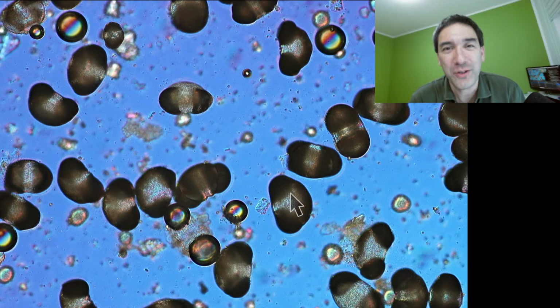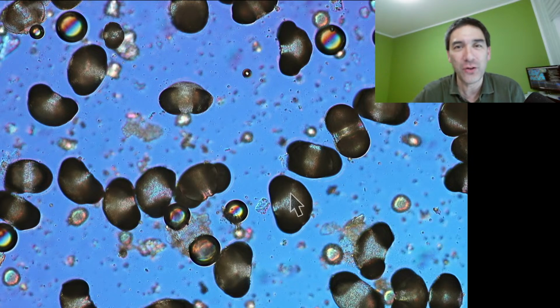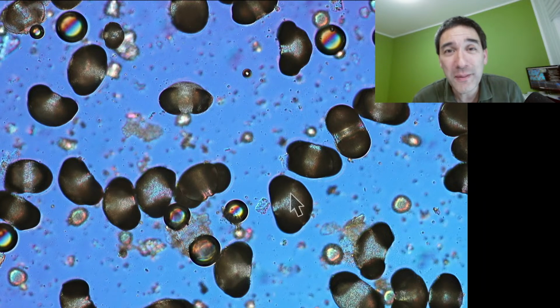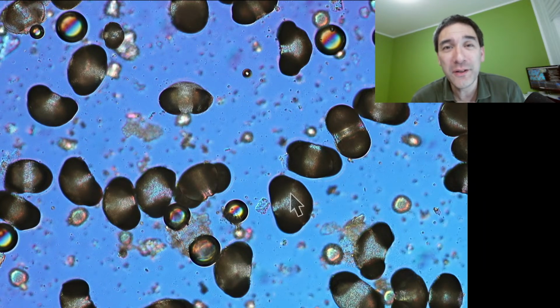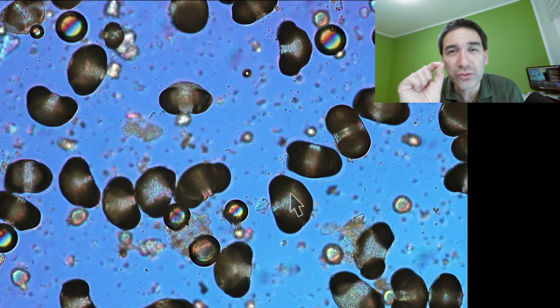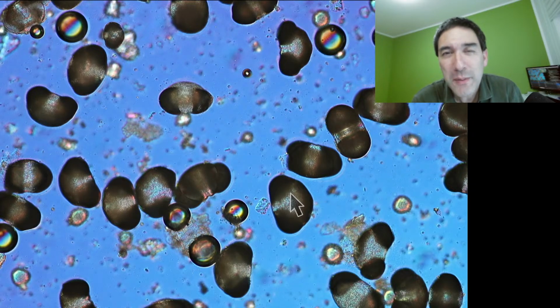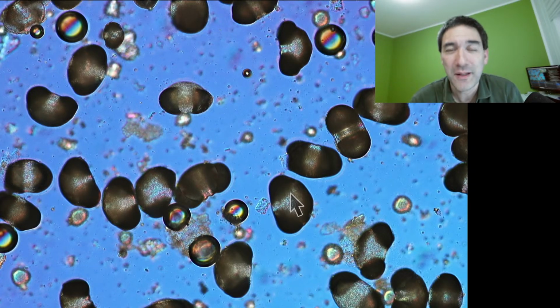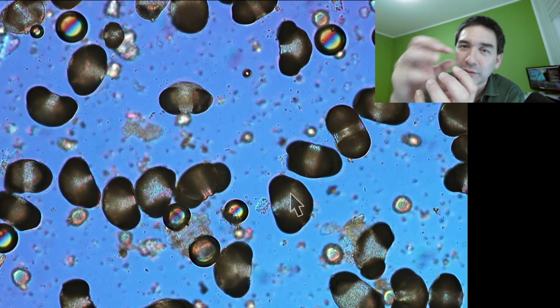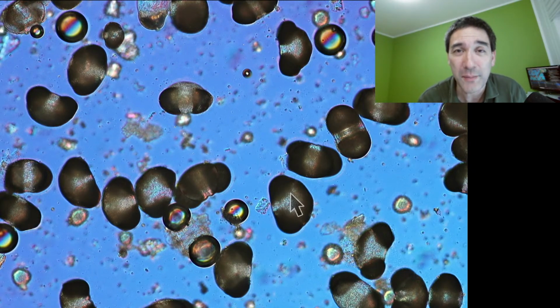Just a short clarification. If you take a strong magnet and go over the surface of, let's say, where rainwater is collected, collect all of the magnetic material, and put it under a microscope, then sometimes, and I've found several of those, you're able to see very round structures, extremely round. These could be micrometeorites, cosmic dust. When they fall through the atmosphere, they start to melt and form those perfectly round, microscopic spheres, and then you can collect them with a magnet.